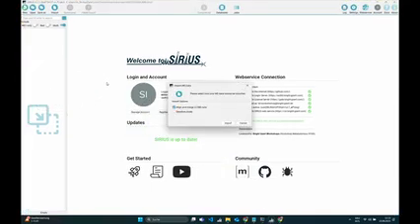If drag and drop doesn't work for you for some reason, you can also use the import button here in the top left. And then you'll be greeted with this dialog, which will ask you if you want to align your runs. And because we have just selected 2 MZML files, which contain multiple LCMS runs, we probably want to align them, so we have features that are aligned between the runs.